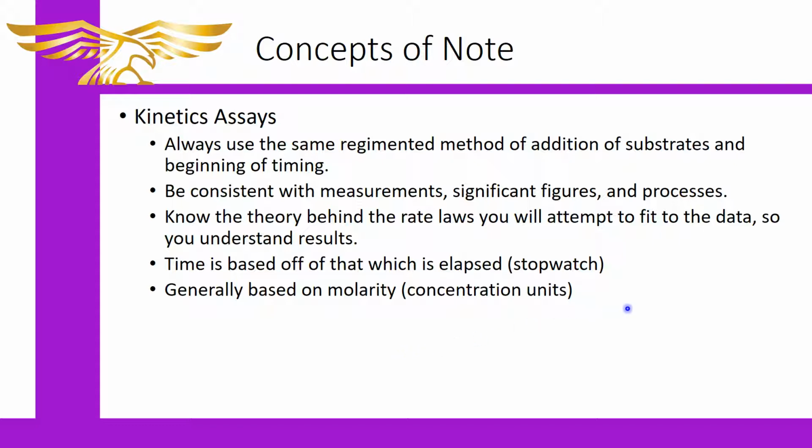Some other tips I'll give you about kinetics assays are the following. You need to make sure that you're being very regimental and very methodical in the way that you set up these experiments. You want to be cautiously quick with getting things into the tube, closing them off, and beginning measurements of the time that's elapsing when you start dropping reactants together.